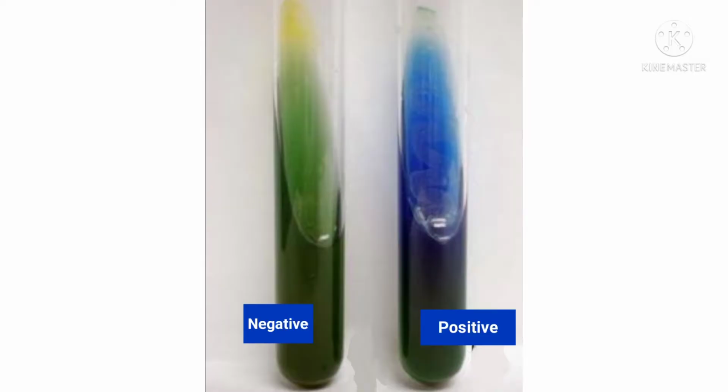Next is the Simmons citrate agar. The ingredients are the same as Koser's media, but agar is added to solidify the media, and bromothymol blue is used as a pH indicator. The media should be poured as slopes. No need to have a butt in the media. The original media is green in color, and on citrate utilization the color turns blue.